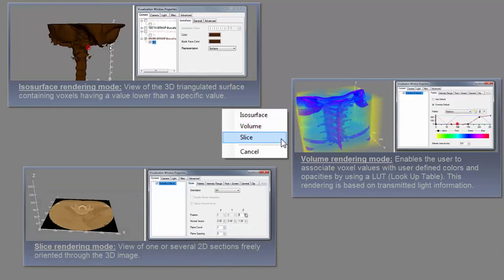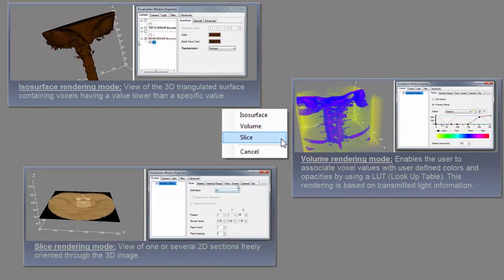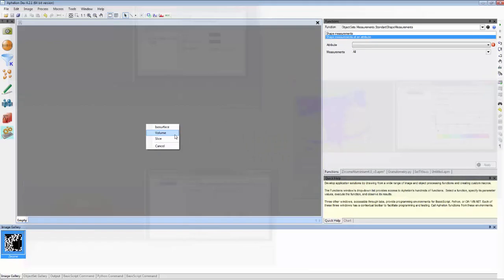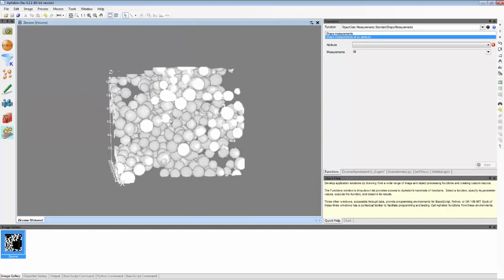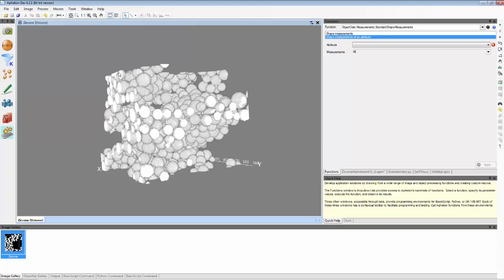or slice rendering to produce one or more 2D sections in a user-chosen orientation. The image can be easily rotated into any orientation in order to view the features of interest.